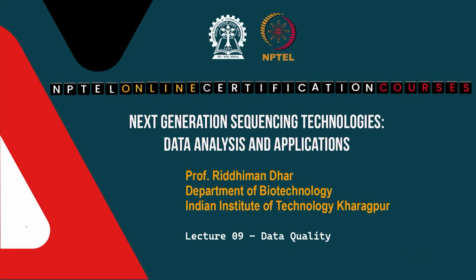In the last few classes we have talked about data formats from different sequencing platforms. Especially we have talked about the FASTQ format, which is used by the Illumina platform. We talked about the FAST5 format used by Nanopore. We talked about other formats which can be converted to FASTQ, for example SMRT as well as Ion Torrent. So, in today's class we will talk about the data quality.